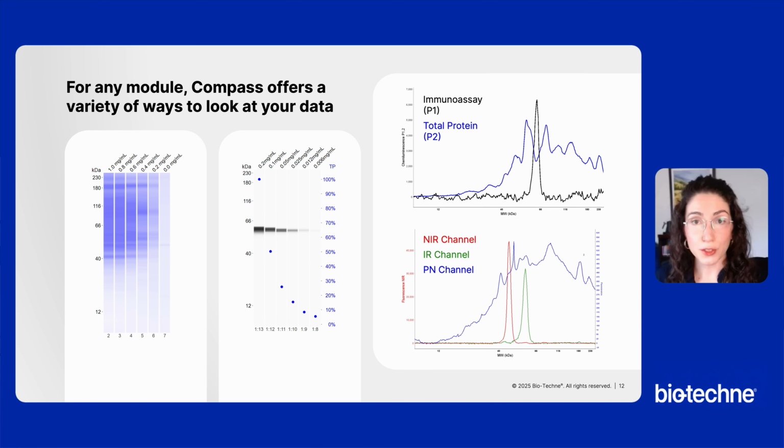Let's take a look at how total protein normalization is visualized in our Compass software. On the left, we have our lane view. This is an image based on our quantitative electropherograms that is modeled on traditional Western readouts. These samples were titrated, and we can appreciate how the blue total protein stain decreases in intensity with each dilution across the lanes.